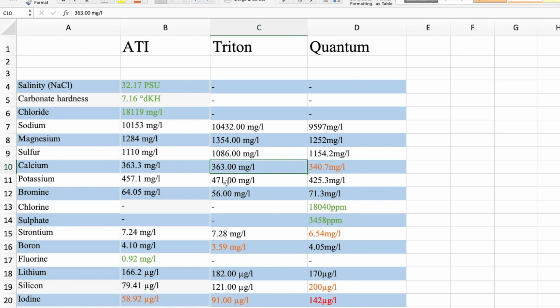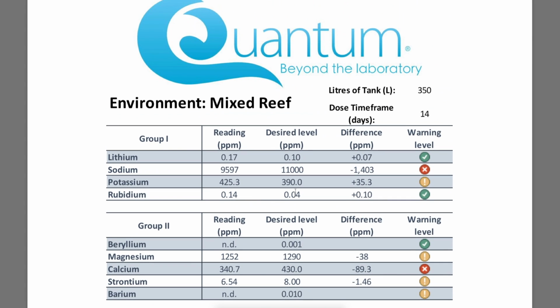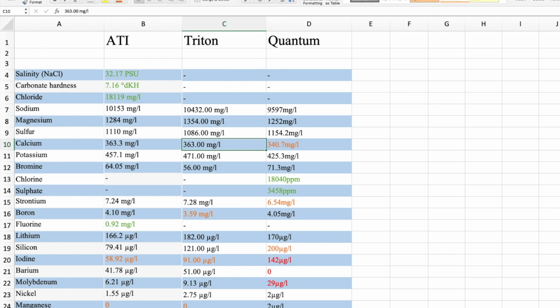One thing I will quickly point out here, the Quantum results, which I can jump back onto their screen or their website, the Quantum results are in ppm, not UGL. So where I'm comparing them, you see here like the chlorine is not tested by ATI or Triton, so I have not converted it. On the other rows where we are comparing, I have converted it. So just bear that in mind.